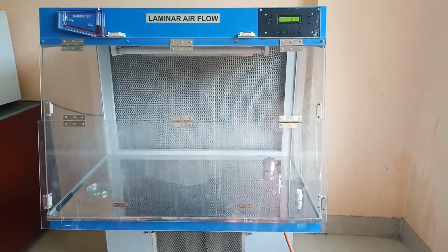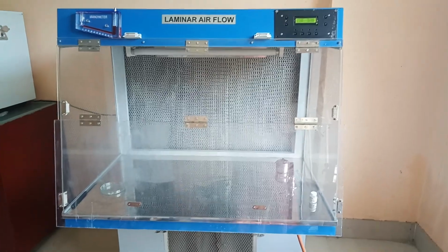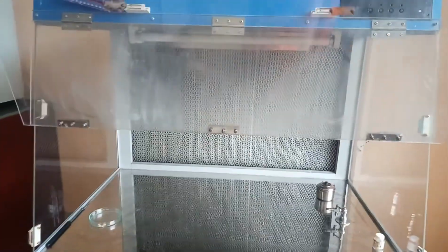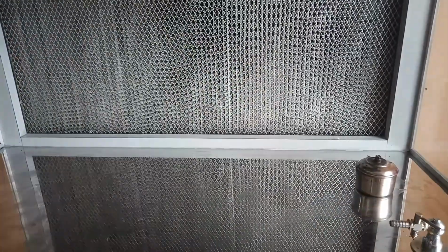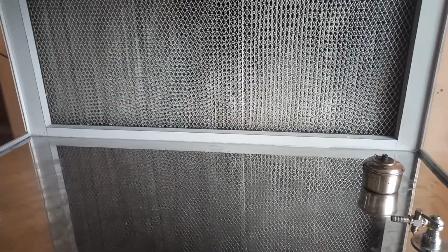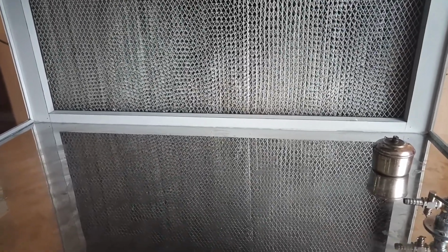If we look on top, inside the hood, we have a HEPA filter towards the inside. It is called a HEPA filter, high efficiency particulate air filter, that does not allow microorganisms to come and contaminate the plates. The purpose of carrying out experiments inside a laminar airflow or a biosafety cabinet is to ensure that microorganisms do not contaminate other substances. Also, the microorganisms that we are trying to isolate do not get contaminated by other forms of microorganisms.